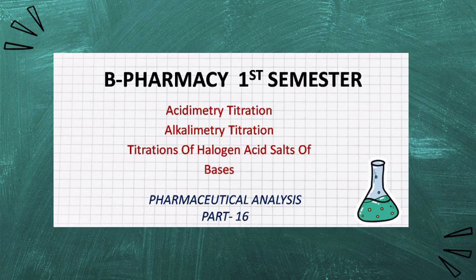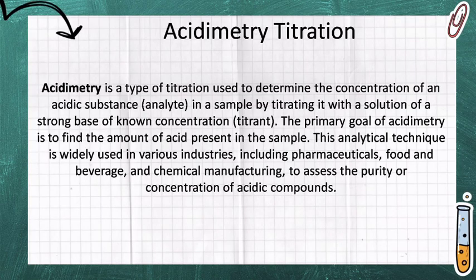In today's video we will continue the previous topic, that is non-aqueous titration. Topics covered in this video are acidimetry titration, alkalimetry titration, and titration of halogen acid salts of bases. So let's start. Acidimetry titration.